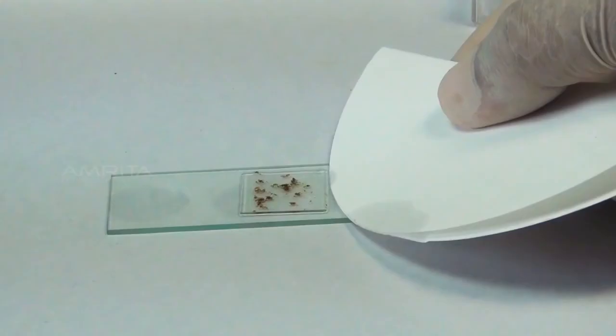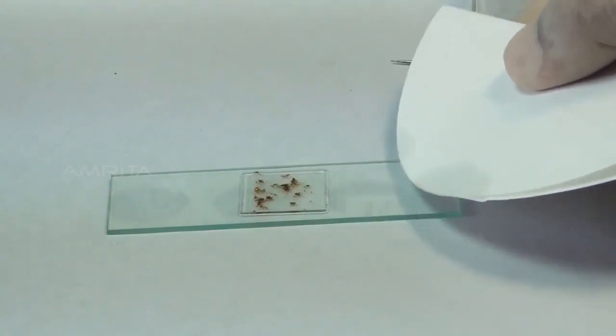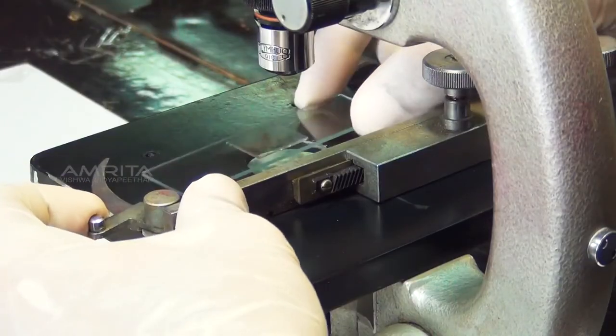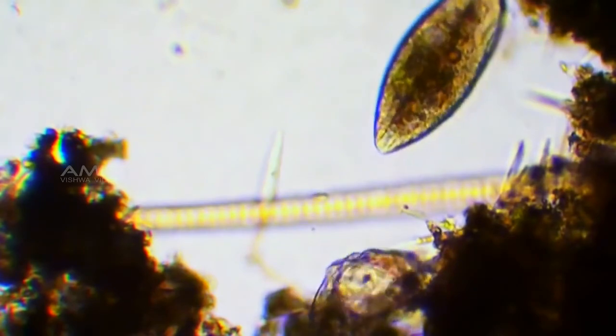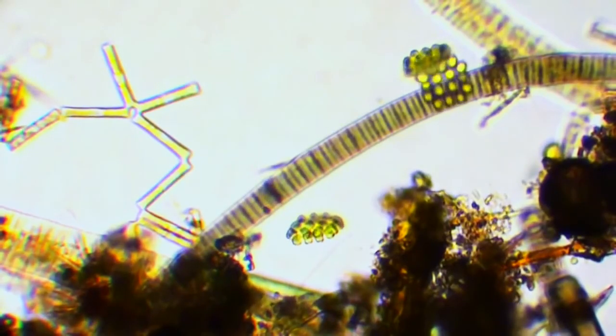Remove the extra water using a filter paper. Place this glass slide on the stage of the compound microscope and view it. Observations: we can observe a large number of different organisms in the water sample.